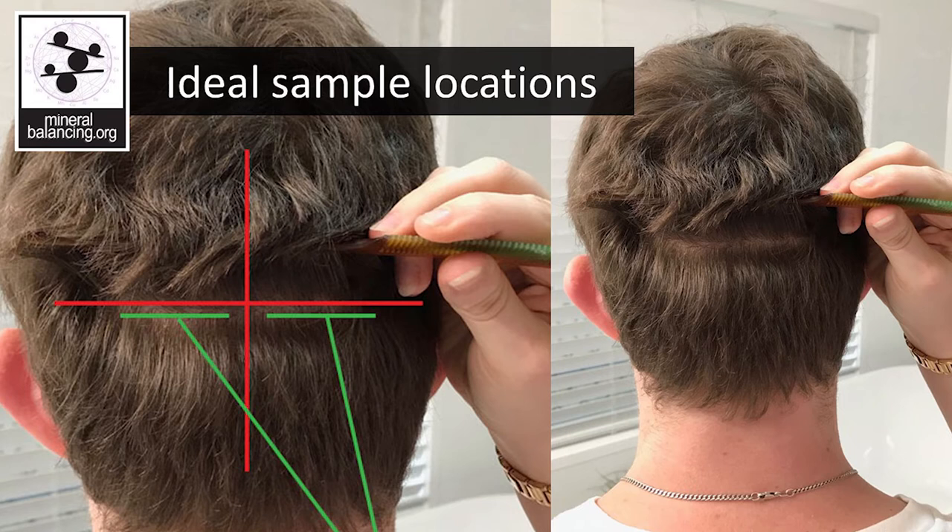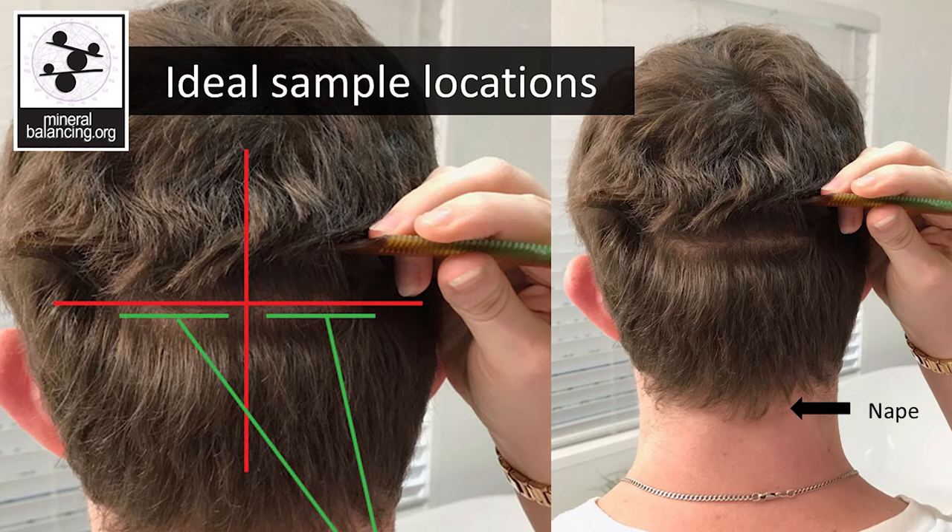The ideal location for a hair sample is the occipital region of the head. This is a fancy way of saying the back of the head, as shown here. The samples will be taken from the area shown. This is the best location for a hair sample. However, you can also include some of the hair from the nape of the neck, though this hair is very light and doesn't make much of a difference for the sample weight.